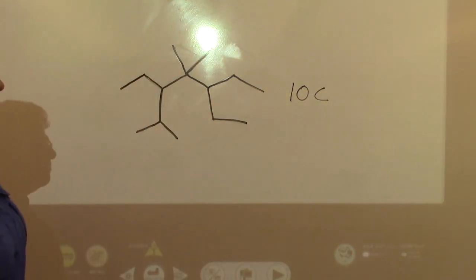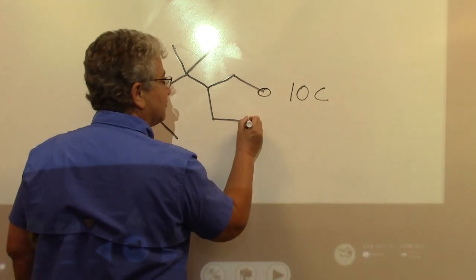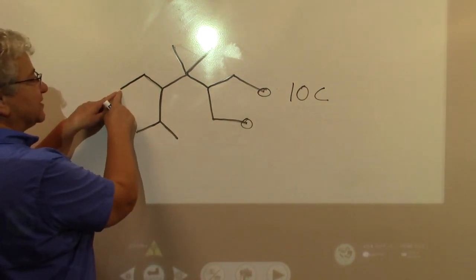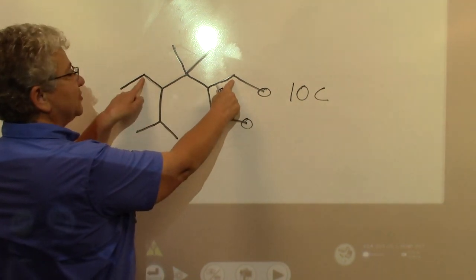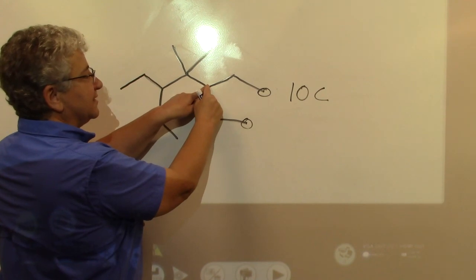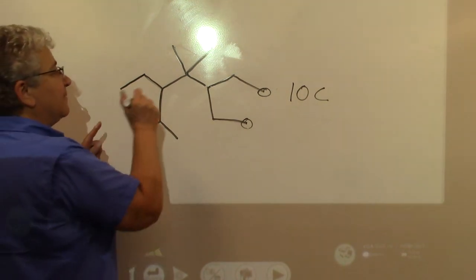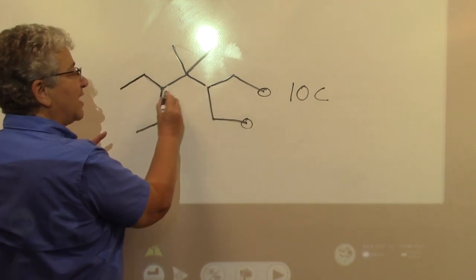10 carbons, 10 peaks. You will see 10 peaks. And so that CH3 group is the same as that CH3 group. And the question is often, is it the same as this one? Well, CH2, CH2, CH2. But then these two CH2s meet. And so that branch is exactly the same as that branch, because then they go through the rest of the molecule together. But this carbon and this carbon are not the same, right?